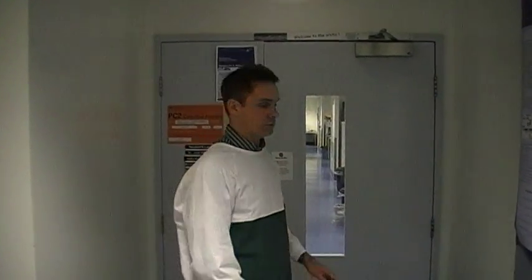Hello, I'm going to show you our molecular biology laboratory where we manipulate gene activity in zebrafish embryos in order to investigate Alzheimer's disease. Through this door you'll see our molecular biology laboratory.